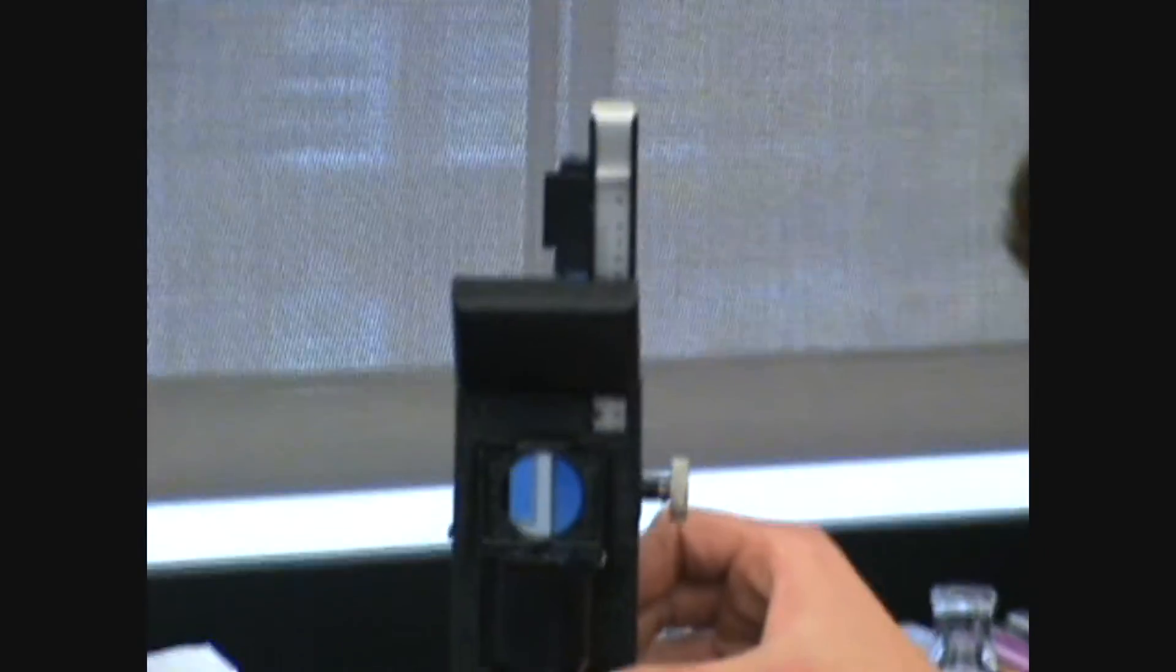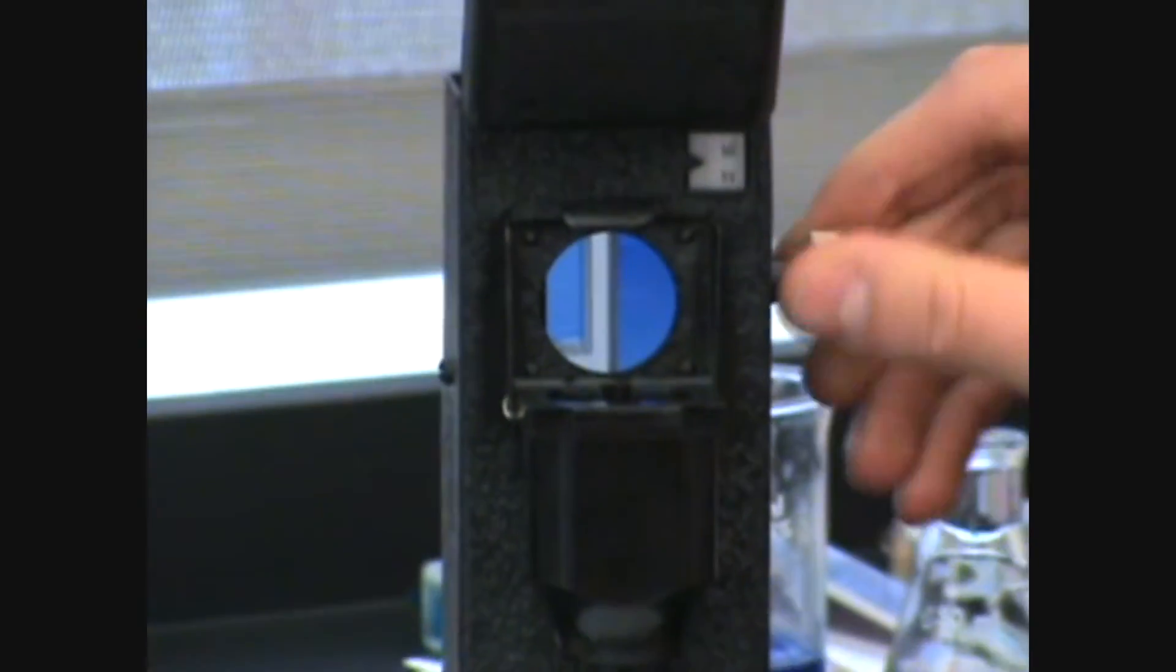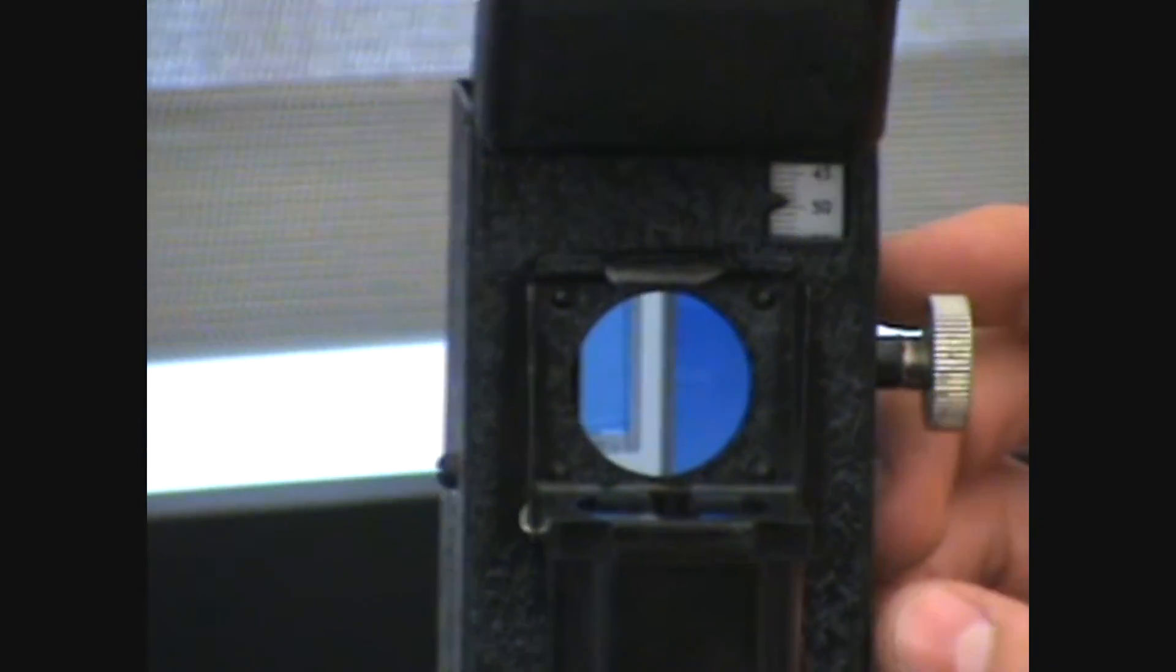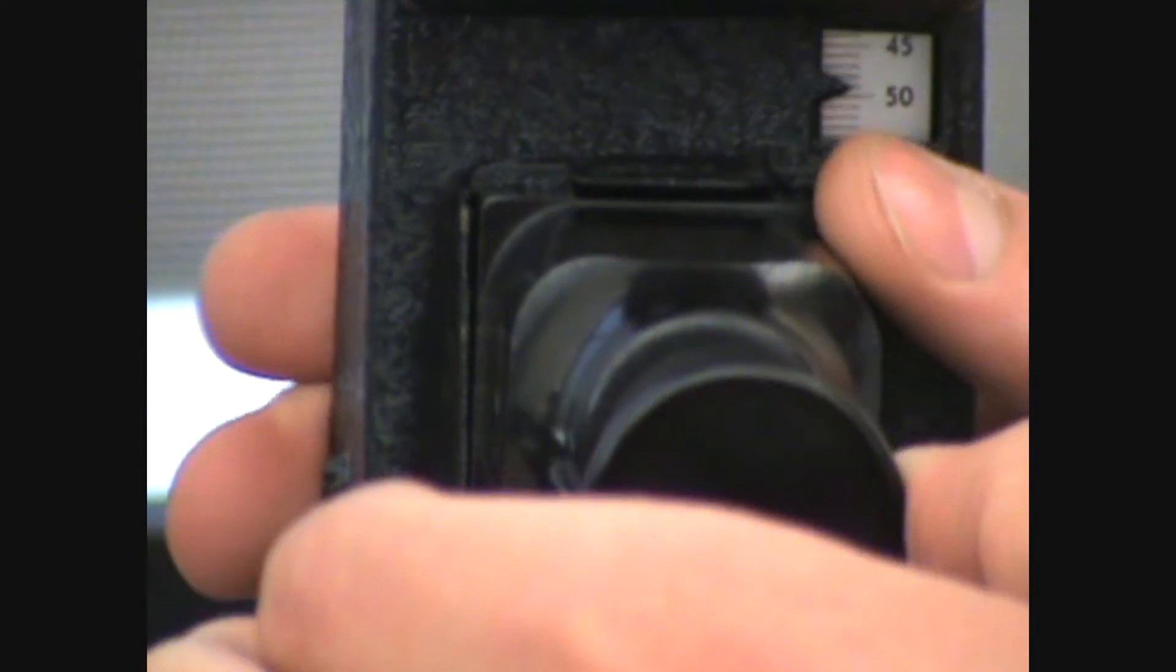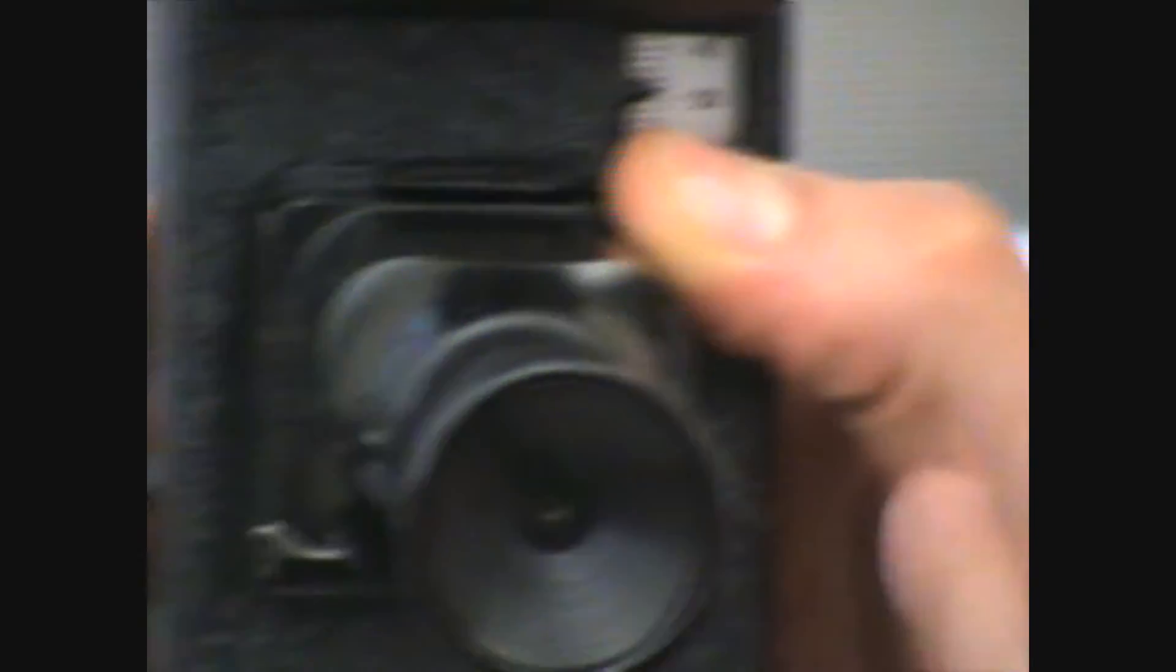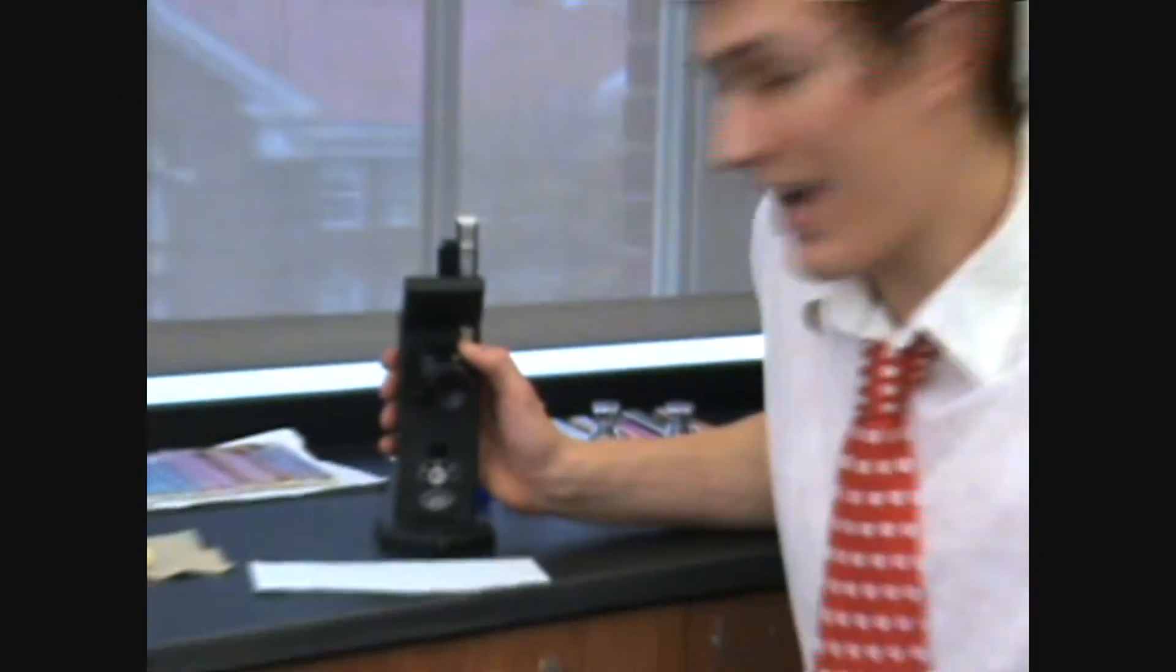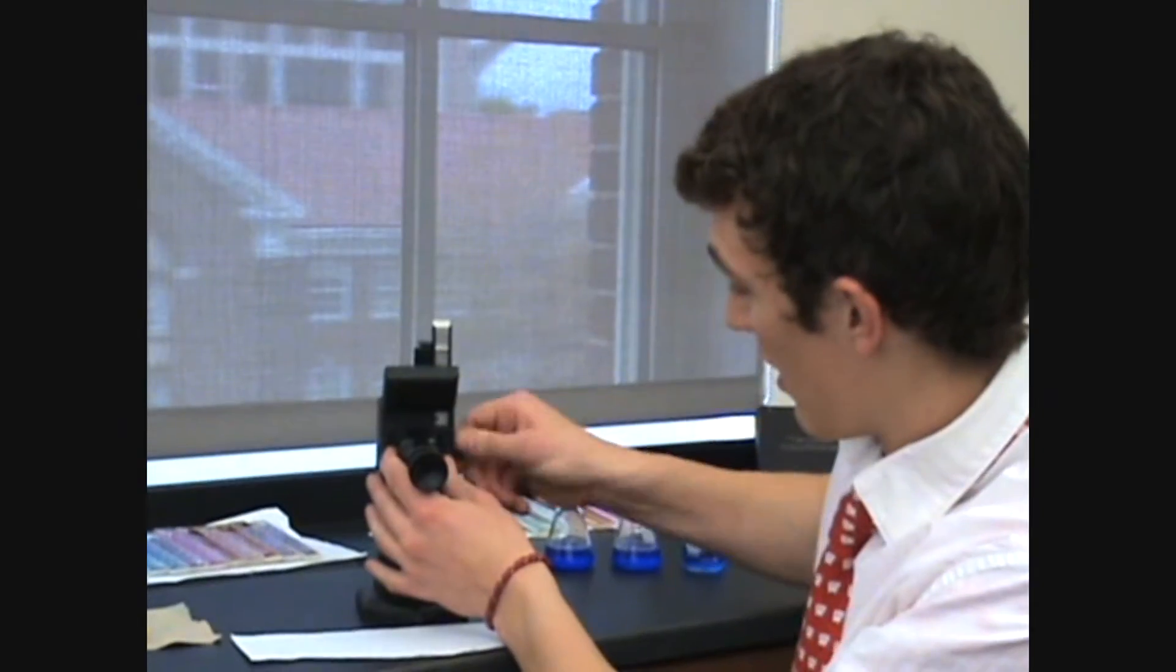Then, if you look through this hole right here, you can see that both the standard and the unknown cup are visible. So, then when you put the eyepiece up, you look through the eyepiece and it compares them side by side. And you match them until the intensity matches.